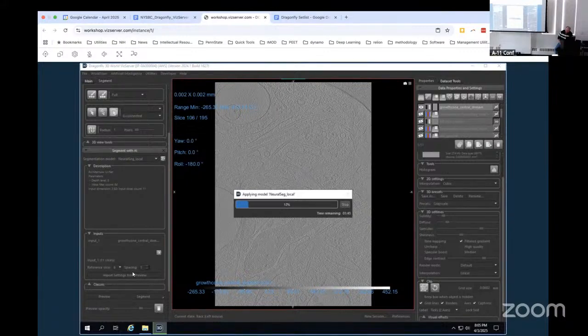You said with neuroseg, it's kind of random whether or not it likes the noise inputs. Not with neural seg specifically, just any general network I've used. We can actually do that. In fact, next we should play around with some denoising and try segmenting it and see what happens. When I first started doing it, I thought, oh, this is going to be amazing. Like once I denoise this, the segmentation is just going to be so easy. It hasn't been quite like that.